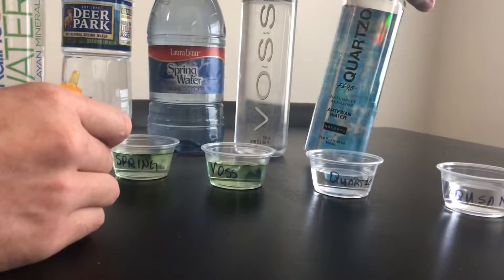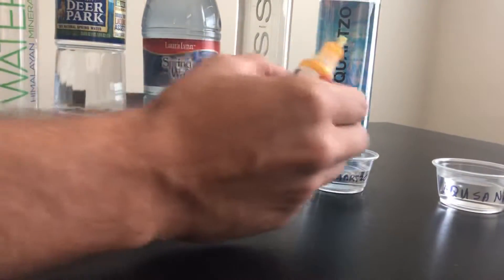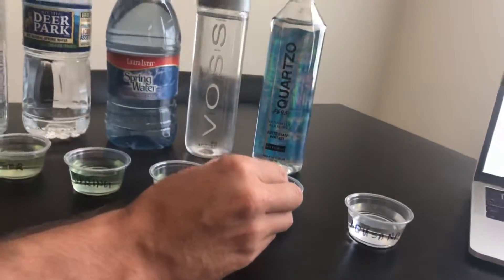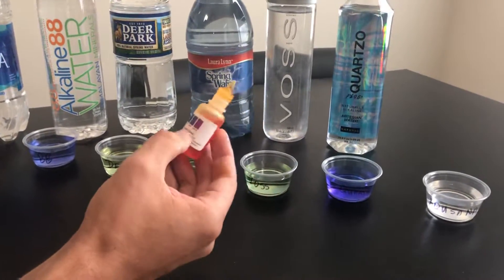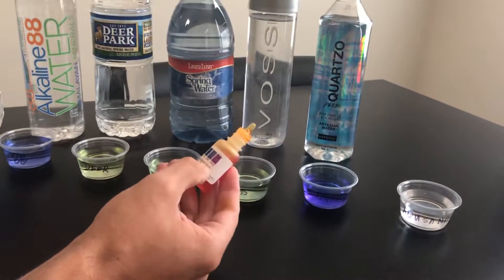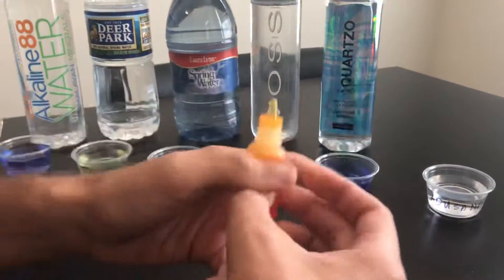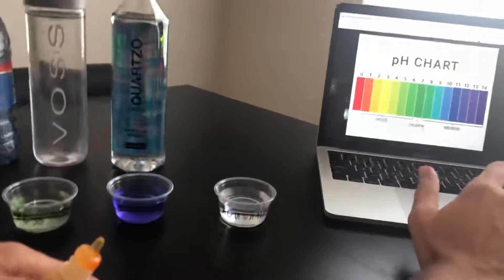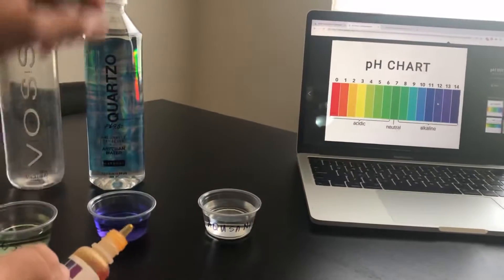There's another one called Quartz — it's advertised as about 9.5 or higher, naturally alkaline water. That one is probably the winner because it's probably like a 9 if not 10. Look, it's almost purple — that's like an 11 or 12, that's pretty alkaline.